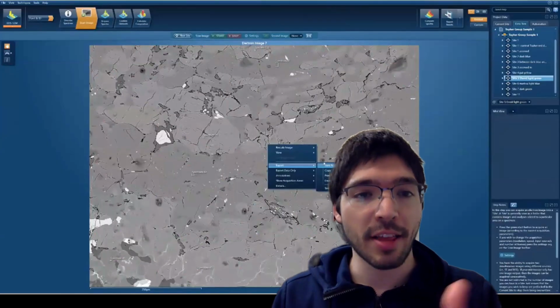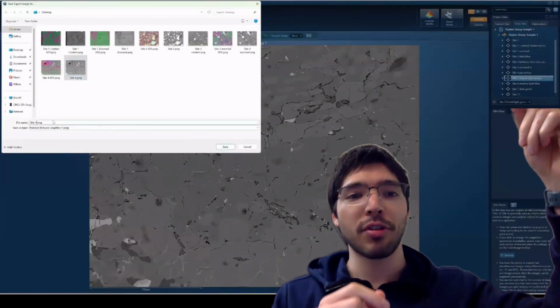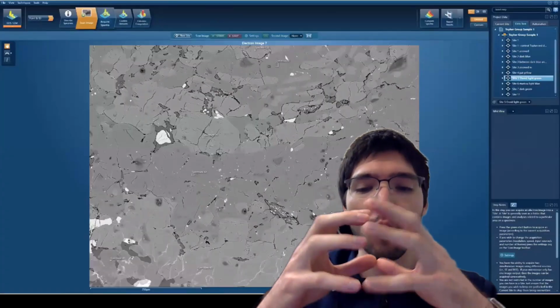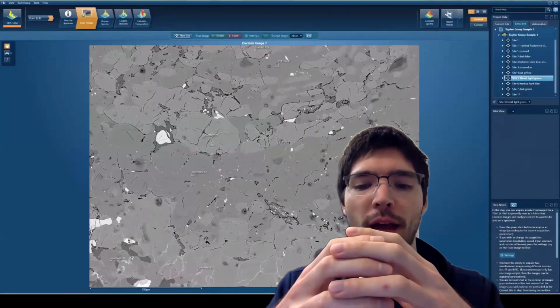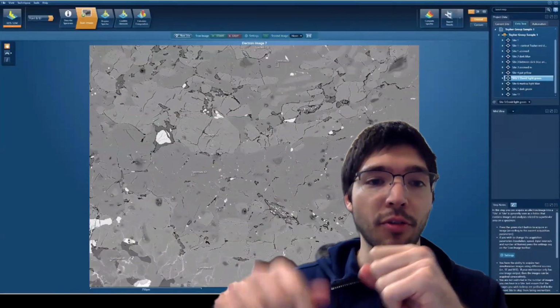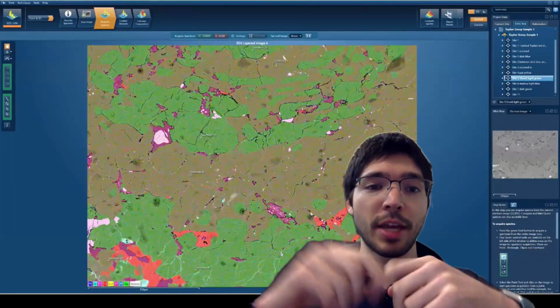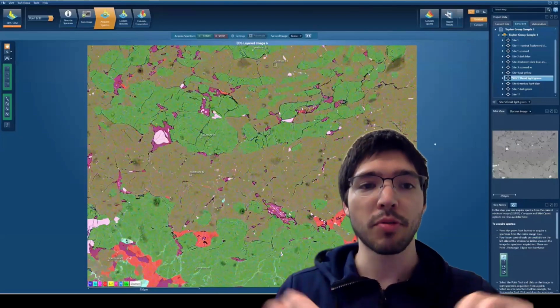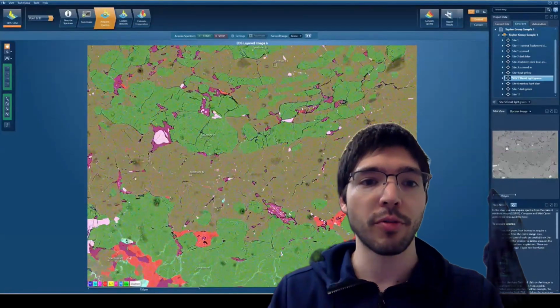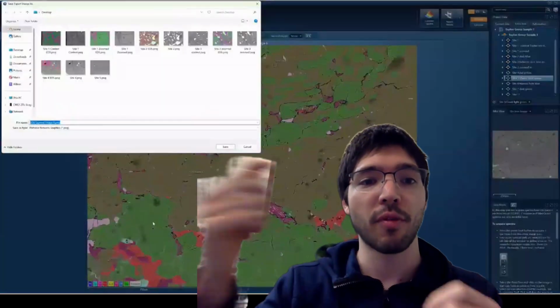And the way these come about, as Pat explained a little bit, is that the other interaction you get is when those electrons can knock off secondary electrons from the electron orbitals in your atom. So essentially, if you envision the atom as having a nucleus and different electron shells that go around it, those primary electrons from the beam can knock off some inner orbital electrons, from some of the closest ones to the nucleus, and outer shell electrons will try to fill in the place. This is called trying to maintain equilibrium. And in doing so, it releases a burst of energy in the form of an X-ray.